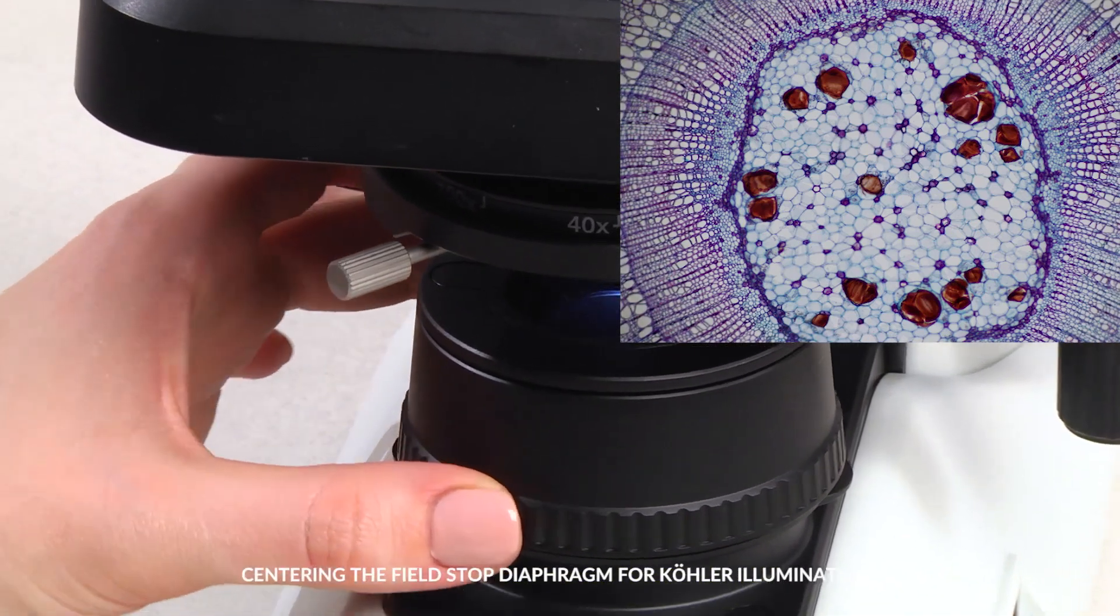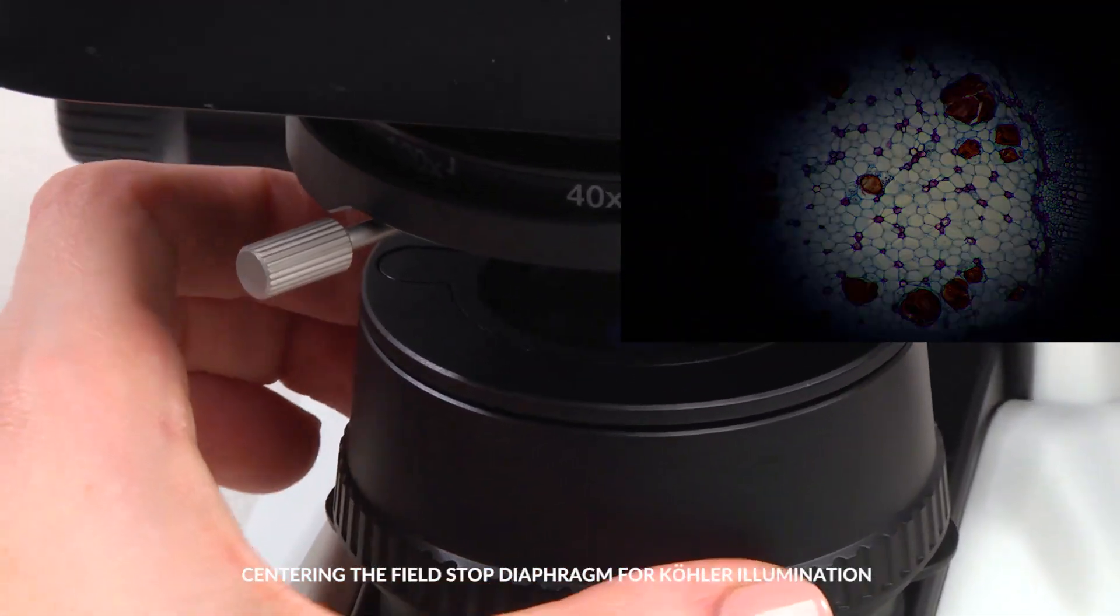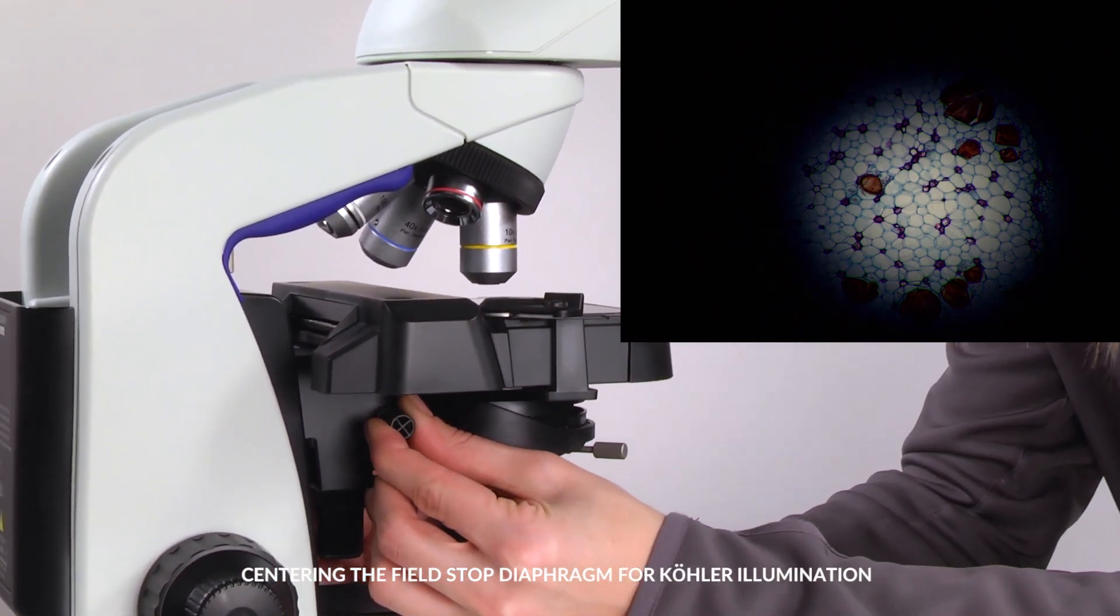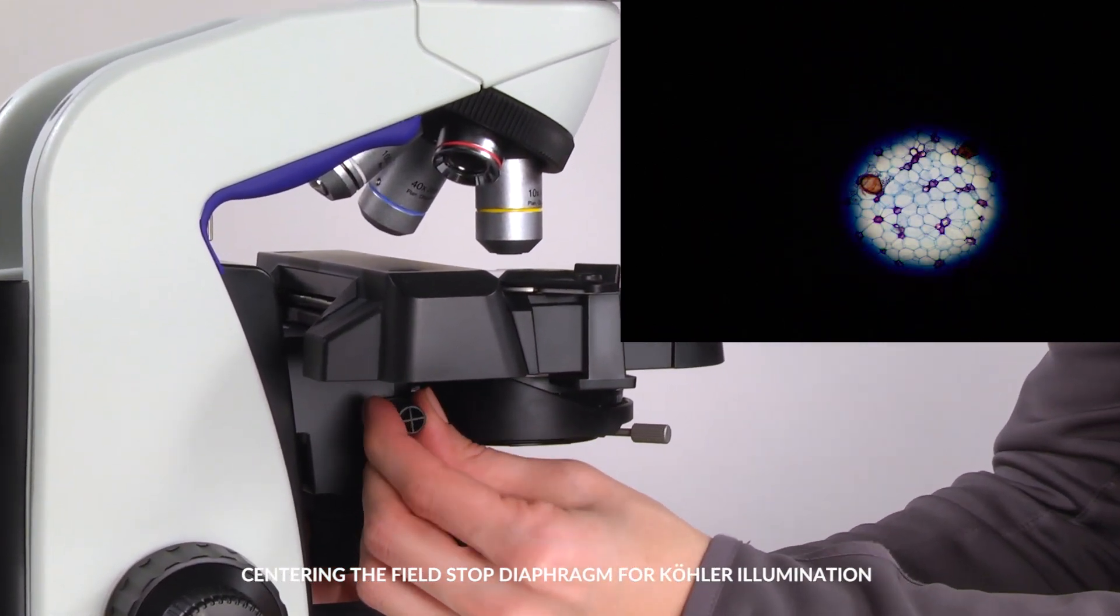Rotate the field diaphragm to the right to narrow the diaphragm image. Rotate the condenser height adjustment knob to bring the field diaphragm image into focus.